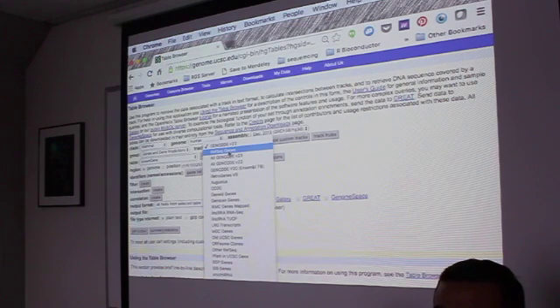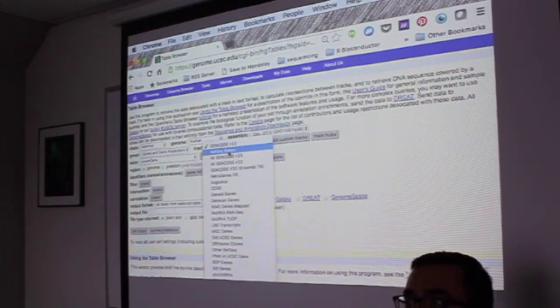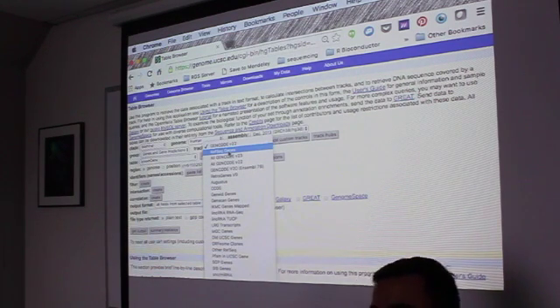You can also go to Ensembl and download your reference genome from there. That will have Ensembl IDs instead. So there are known genes, then there are RefSeq gene IDs, and then there are UCSC gene IDs, and then there are Ensembl gene IDs. So these are all different.